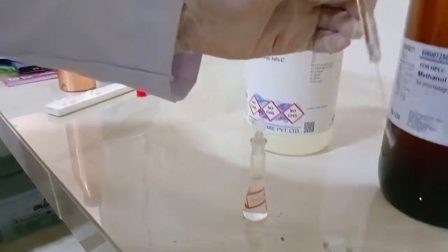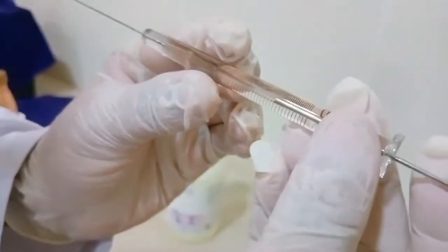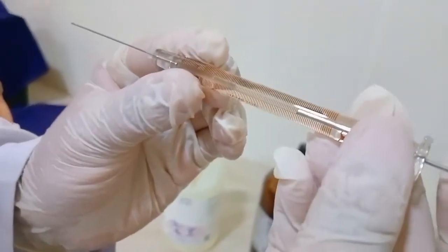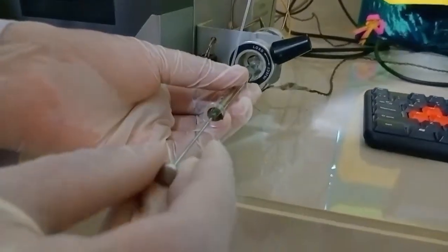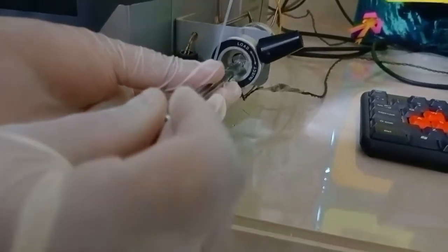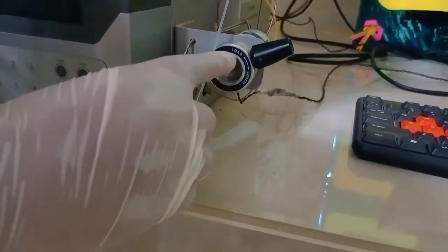After sucking the solution into the Hamilton syringe, we observed whether any air bubbles were entrapped in the syringe. Confirming that no air bubbles are entrapped in the Hamilton syringe, we inject the sample into the injector port through the septum. The sample injection was in the load mode.